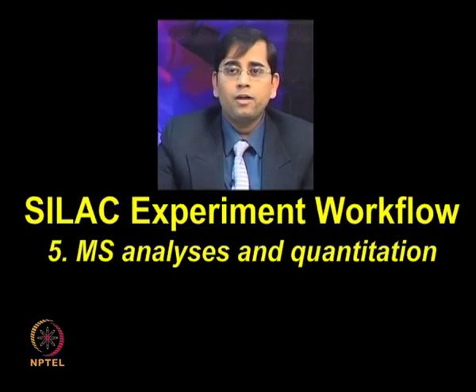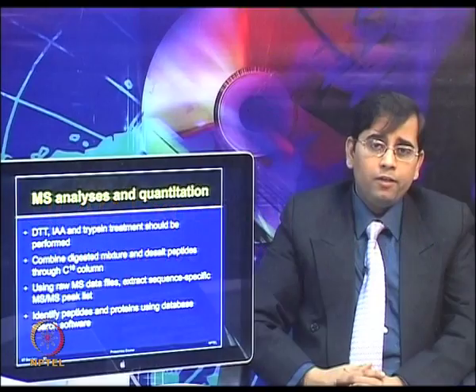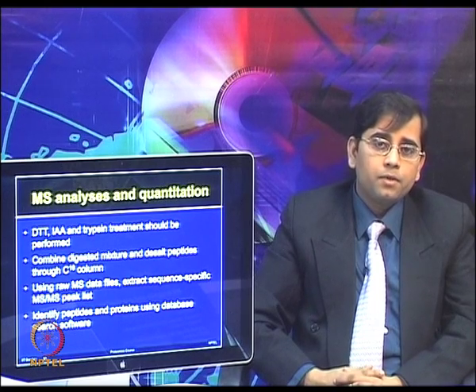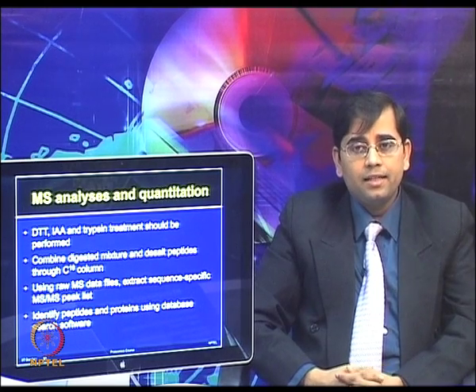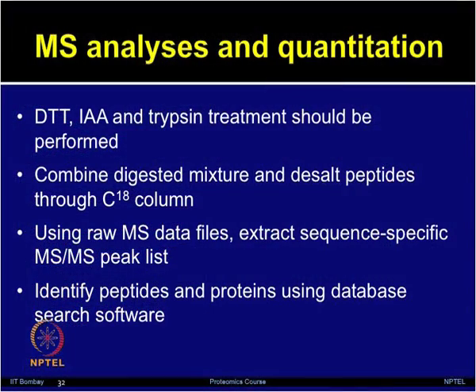In the SILAC experimental workflow, the last and most important point is MS analysis and protein identification and quantification. So, as we discussed earlier, prior to MS analysis, one needs to do dithiothreitol treatment to cleave the disulfide bonds, iodoacetamide treatment for alkylation, and trypsinization for protein digestion.